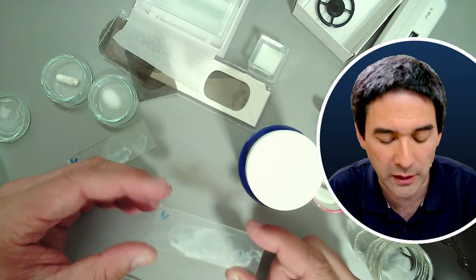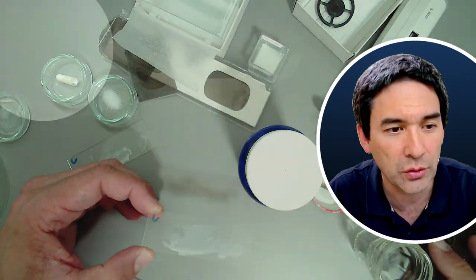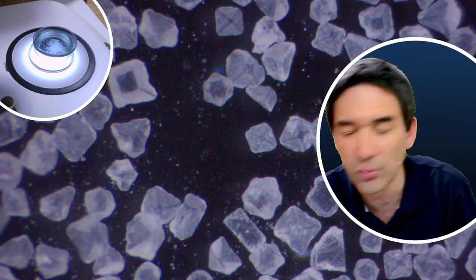Okay, so I'm going to show you now how vitamin C looks under the microscope, and for this I'm going to again switch over to the stereo view, and sometimes my camera will not turn on, so I have to manually switch it on and off. And then I hope that this works again. Yeah, here we go.